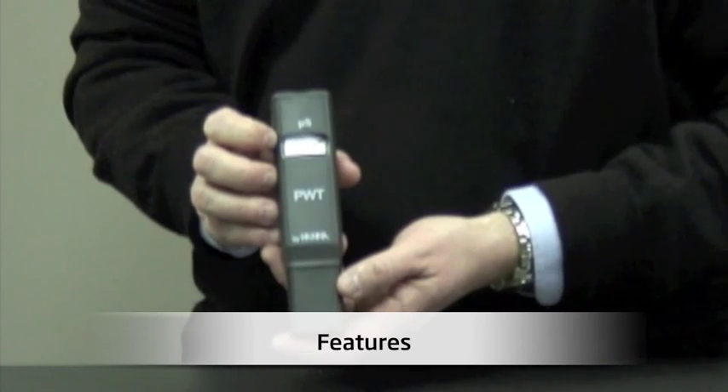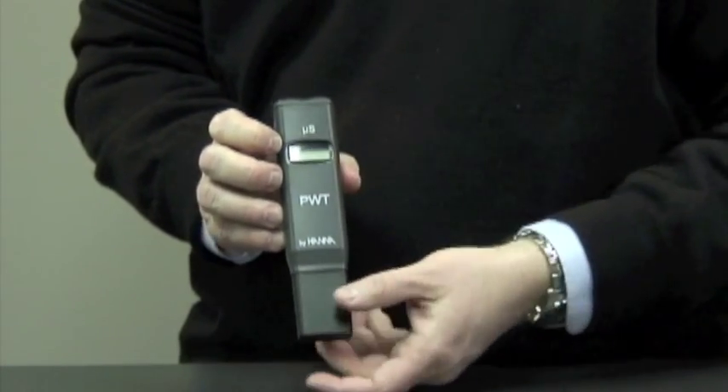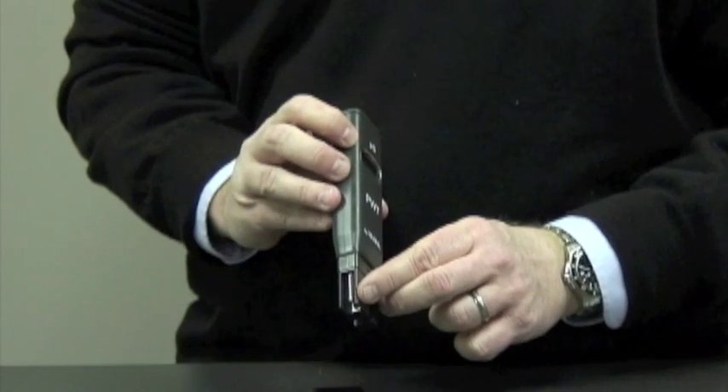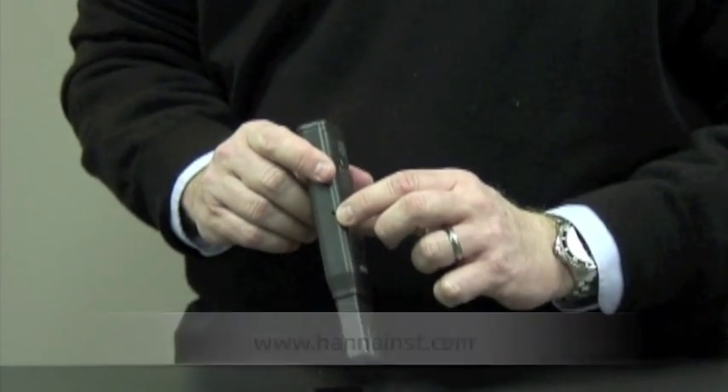I'd like to demonstrate the features of this unit. We have the on-off switch, an LCD display. Taking off the cap, we have a conductivity sensor and an exposed temperature probe for faster response time. We also have the calibration trimmer here on the side.